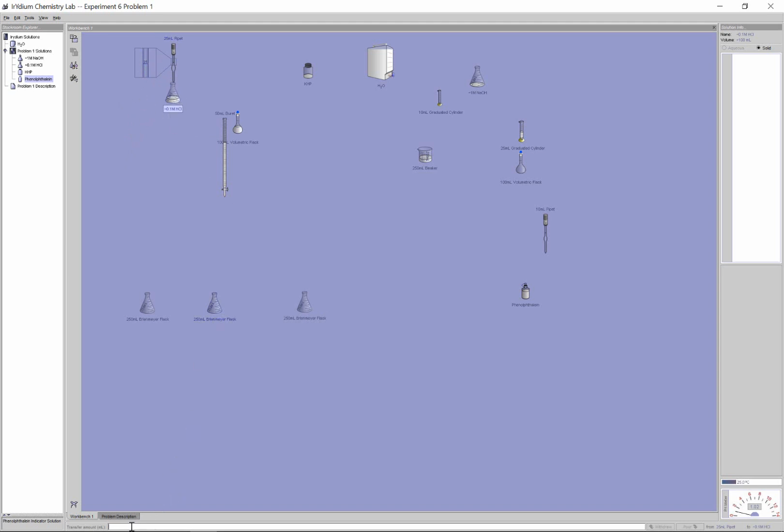Again, I'm going to type in my transfer window here, 25. I'm going to withdraw that up, pull that up as an aliquot, put the 25 in here, dispense that 25 here, do that a couple times so that I can ready a few trials. 25 with the withdrawal, so soak it up like a straw, and then put it back down here, 25, and one last time, 25.